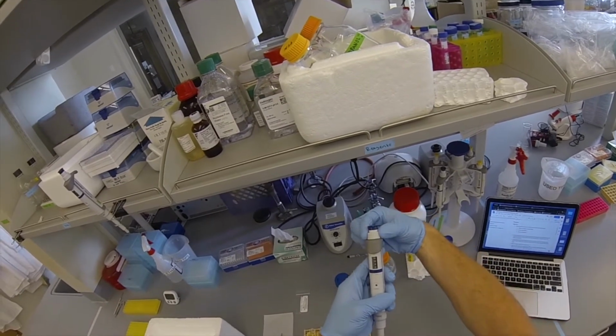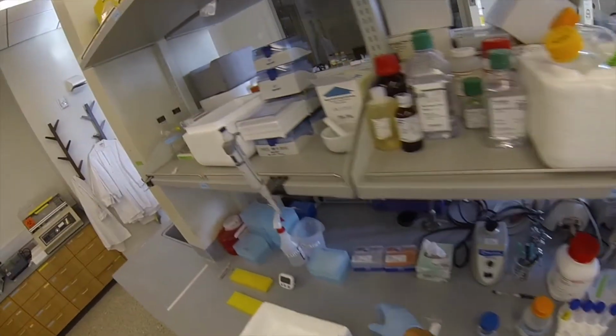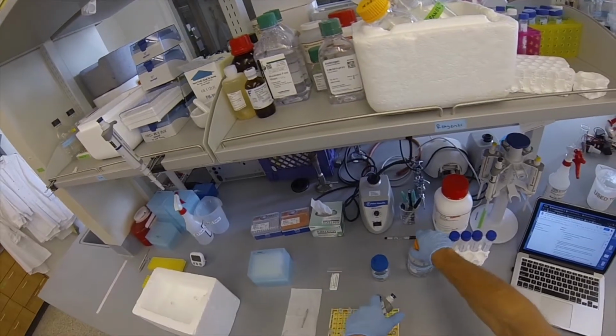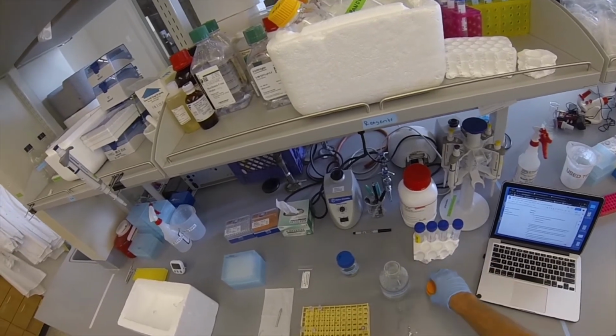Starting with a 1000 microliter pipette, you're going to add 350 microliters of 1% SDS cell lysis buffer to each sample. You should only need one pipette tip for this, but if it ever inserts into the test tube, you need to throw out that pipette tip.